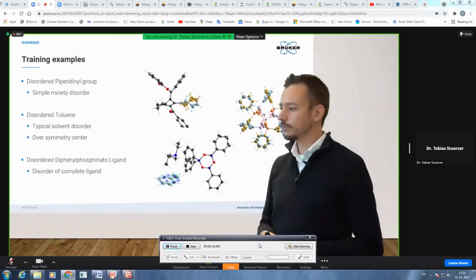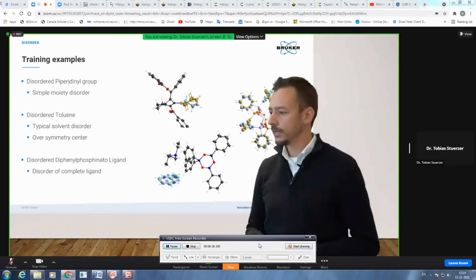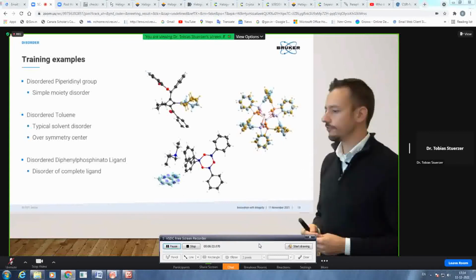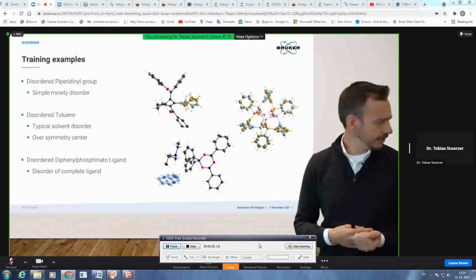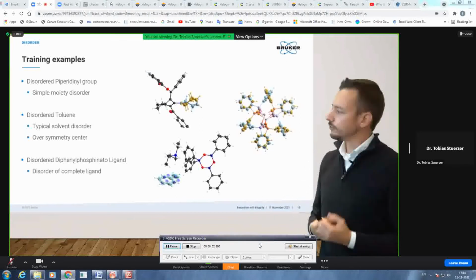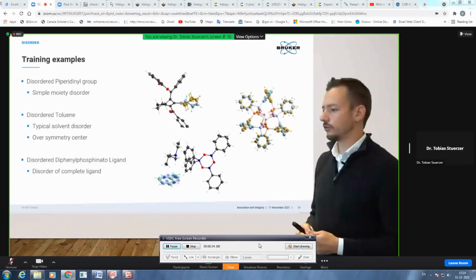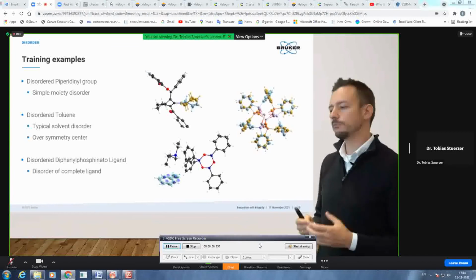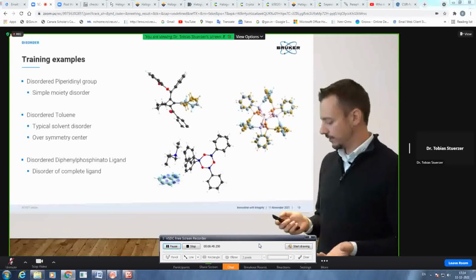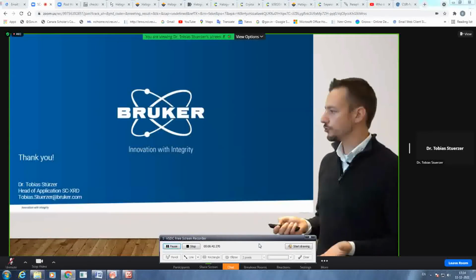So Karsten already put 2 references. Yeah, 2 very nice references on how to model disorder in there. One is from Peter Müller, the other one is from Daniel Kratzert, right? Among others. Read through that. They give very good guidelines on how to properly deal with disorder because there are many things you should keep in mind. I think that is all I wanted to show in advance.